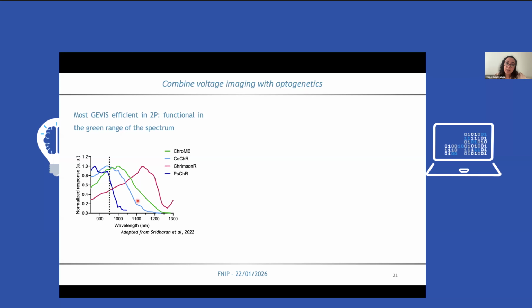And so we have spent a lot of time testing different combinations of opsin, of indicators, trying fast or slower opsins as well. But we could not manage to get a crosstalk-free combination where we would not activate the opsin when imaging. And after a while, we realized that this could actually be somehow super useful for our connectivity mapping, because as I was saying to you at the beginning, we also want to know exactly what we are doing to the presynaptic cells.